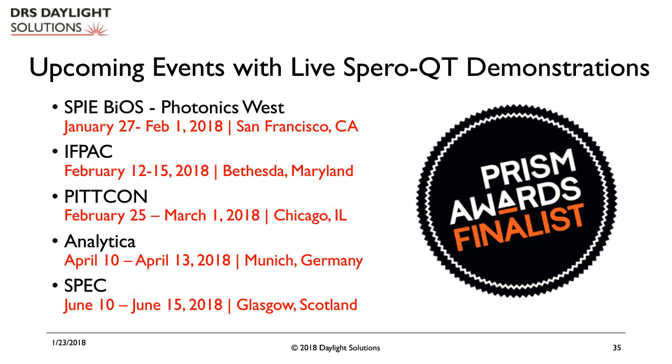Looks like we have another question that just came in. Bill, this goes to you. Can the system be applied for live cell microscopy? Yes, it can. Typically dependent on the specific cell, as shown earlier in one of the videos, we had microfluidic flow cells. So in those cells, either with flowing fluid or with static fluid, we are able to image live cells.